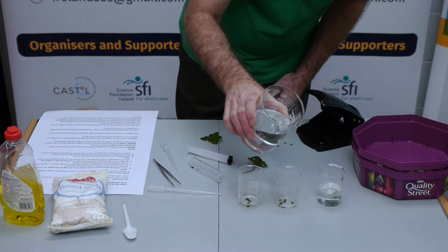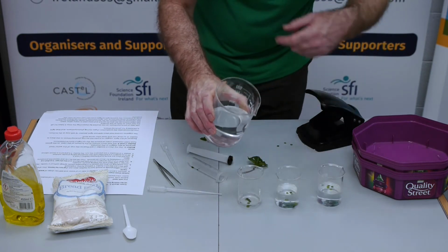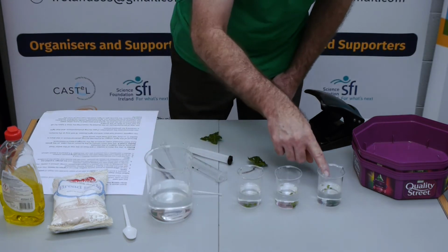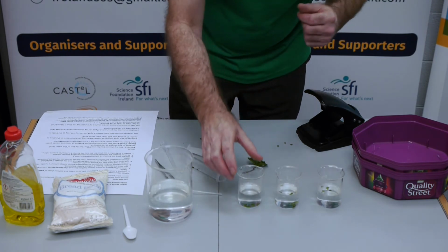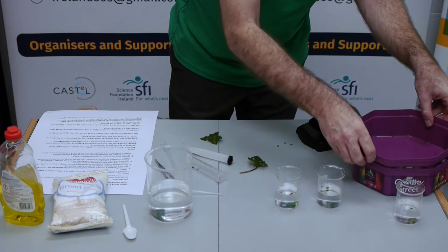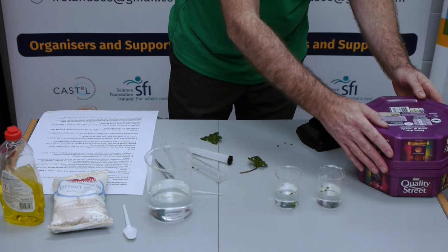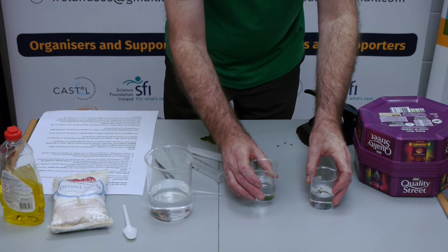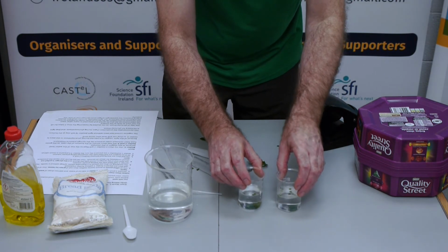What you'll notice is the ones that have been cut directly from the leaf and haven't been treated with the negative pressure of the syringe, they float, whereas these 2 sets sink. One of these, the 3rd beaker, I'm going to put in a cupboard or something, but I'm just putting it in here to keep it in the dark. So this is the negative control. These 2 are also for comparison, but I'm going to place both of these into a bright light.